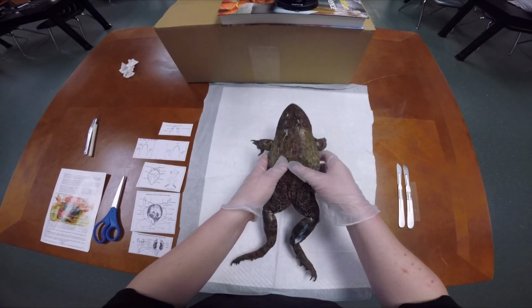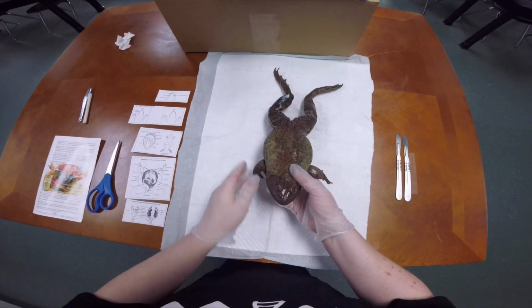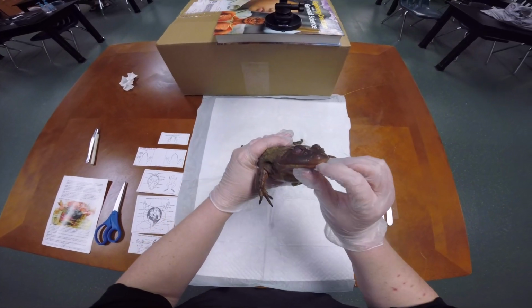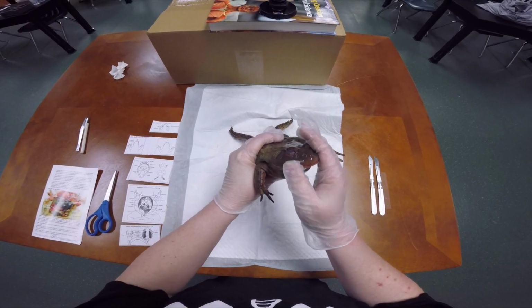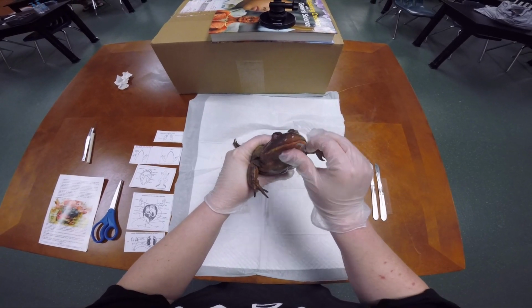Okay, so when we look at our sample, we're going to look at this front part first, and we're going to identify some things on the top. So as you can see here, we have the mouth, which, let's see if I can open that for you. Well, we'll do that in a little bit. But here is the mouth.